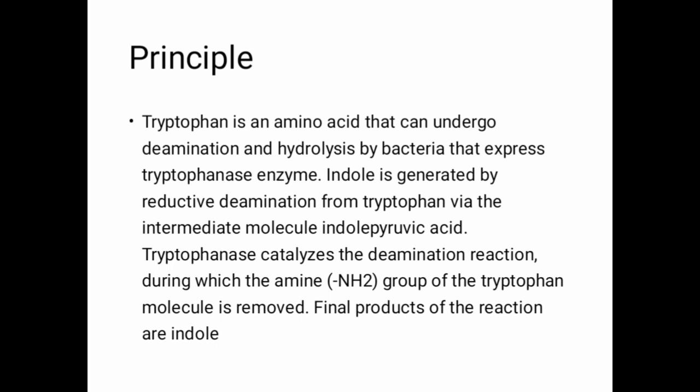So where does the tryptophan come from? Tryptophan is a nutrient present in the culture media, and certain bacteria use this tryptophan molecule as a biomolecule for their growth.